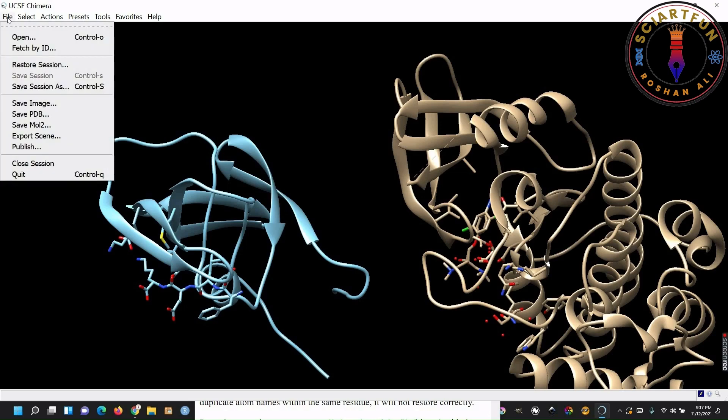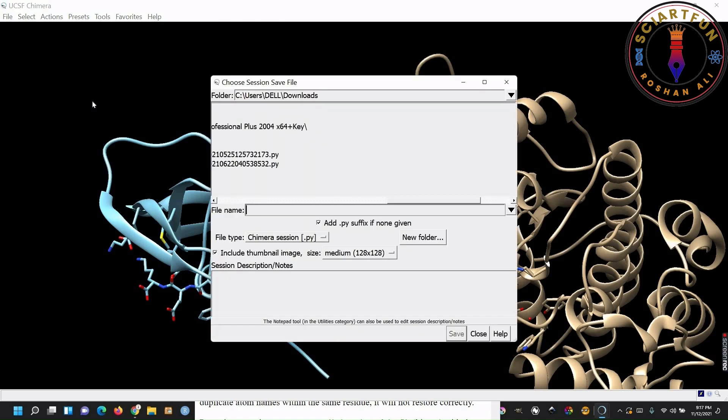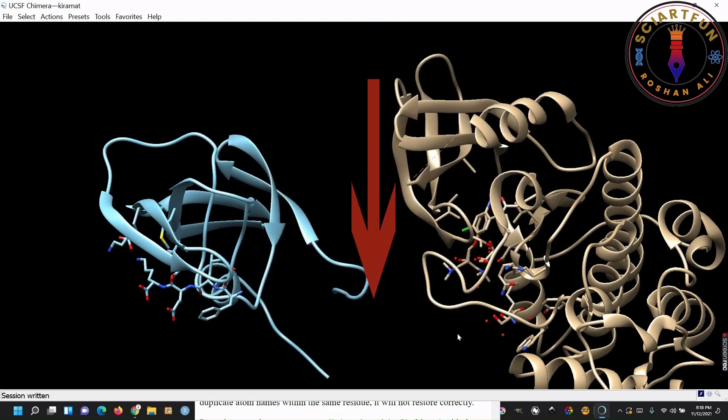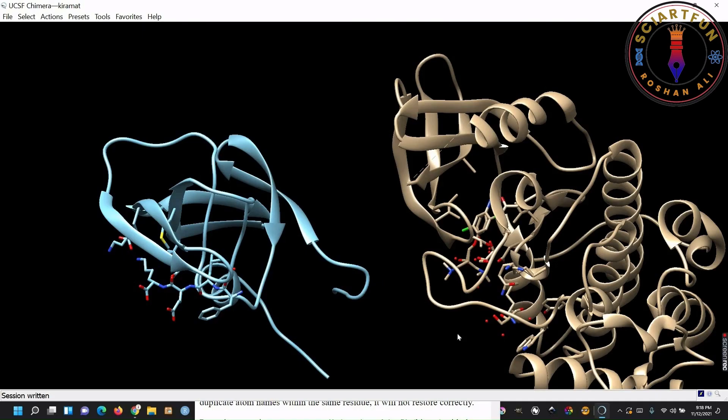Let's now save a session. For this purpose, go to file, click on save session. Type the name of the session. This is the resolution of the file. You can change it. Click save. The session is saved now.